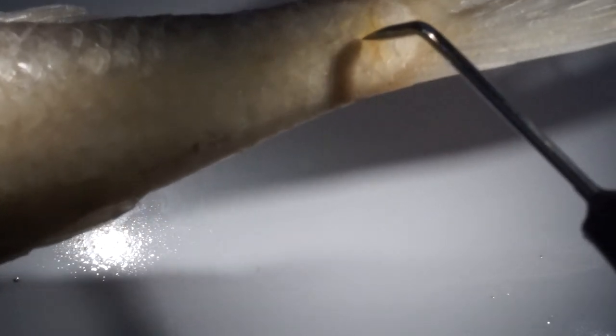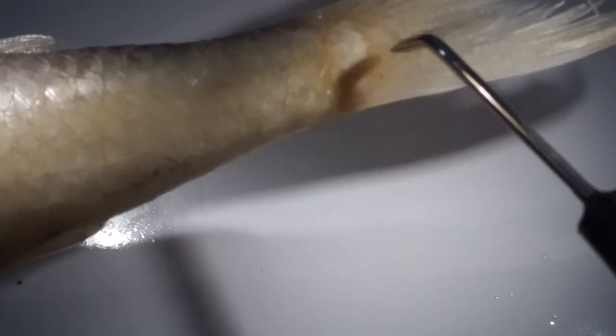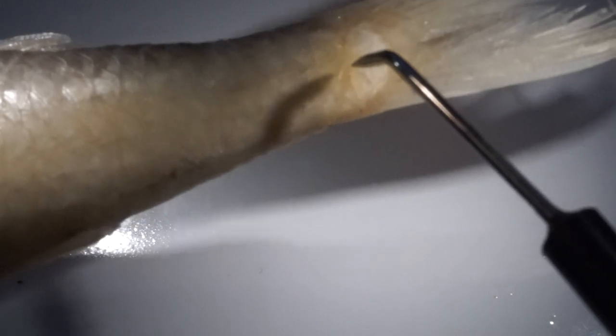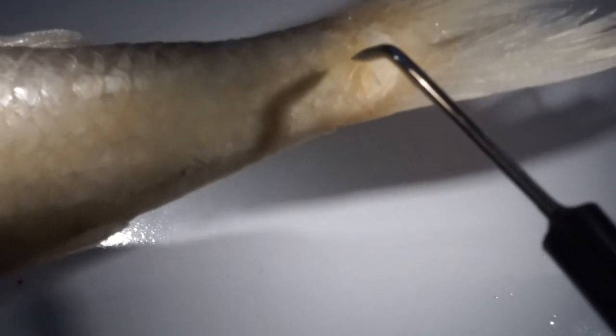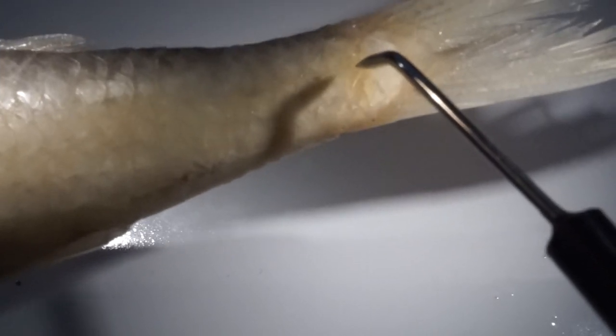Here we have arrived at the end of the vertebral column and close to the base of the caudal fin. So here is the last scale for counting. There are more scales extending onto the caudal fin which are not counted. So 33 lateral line scales in this specimen.